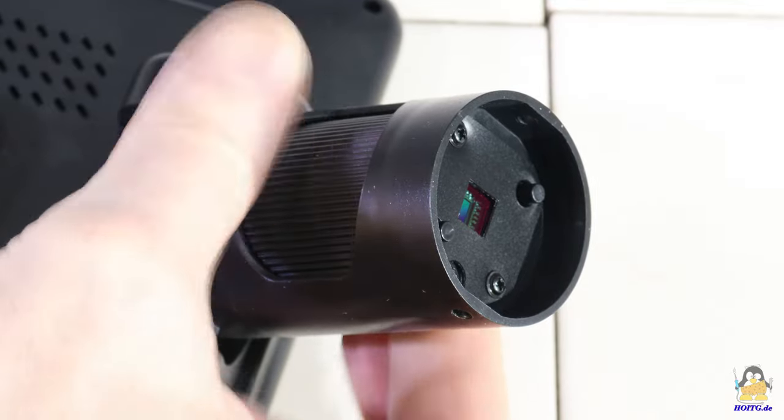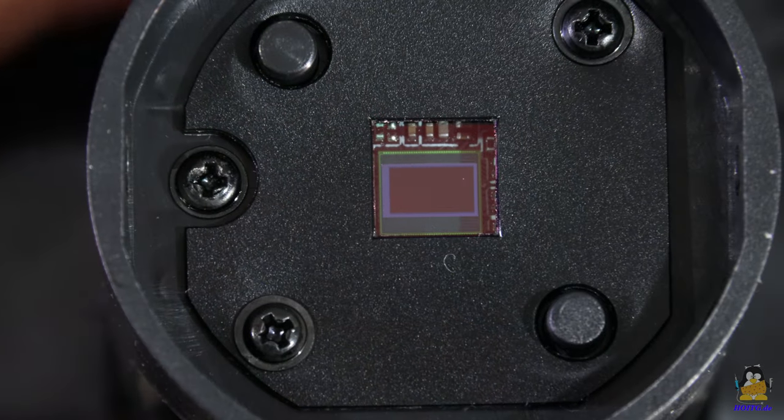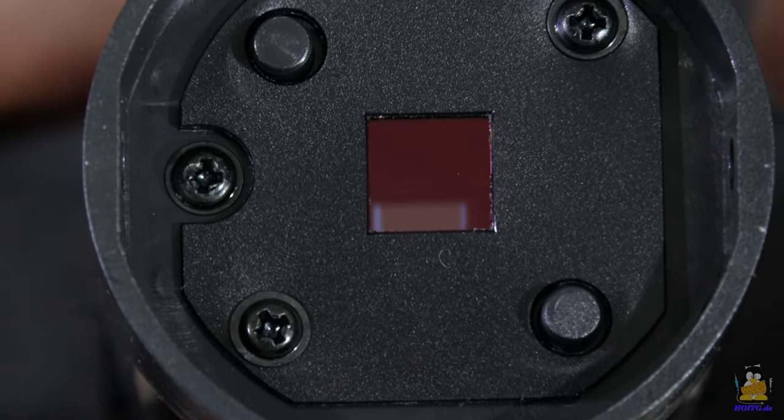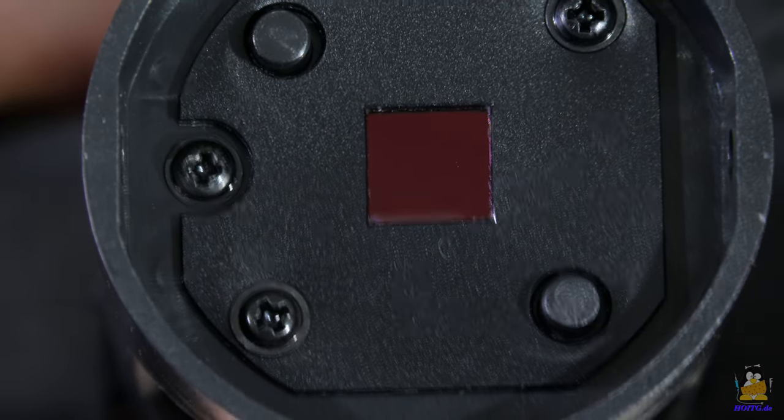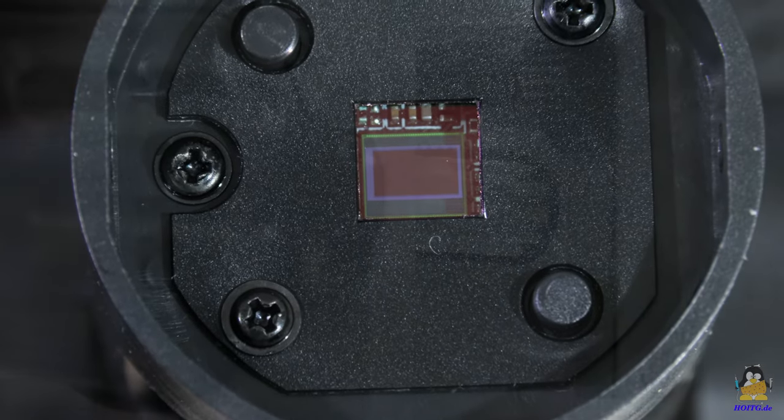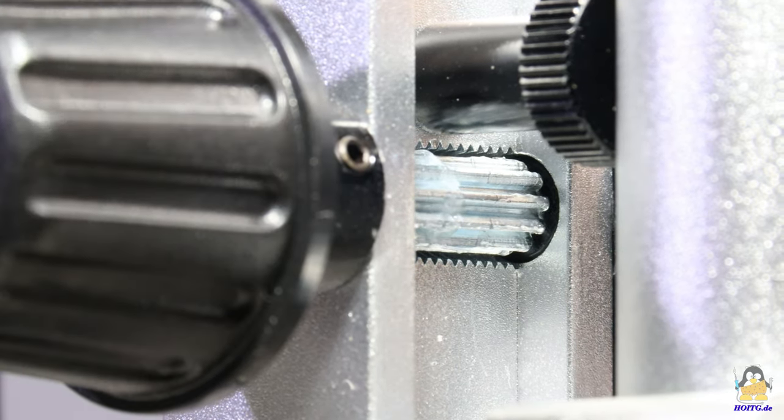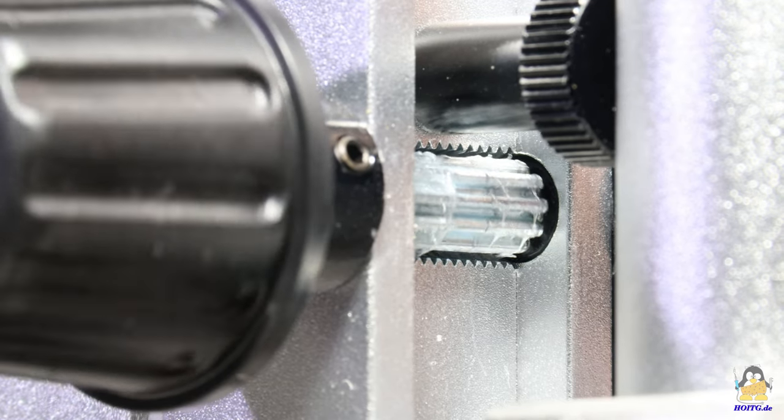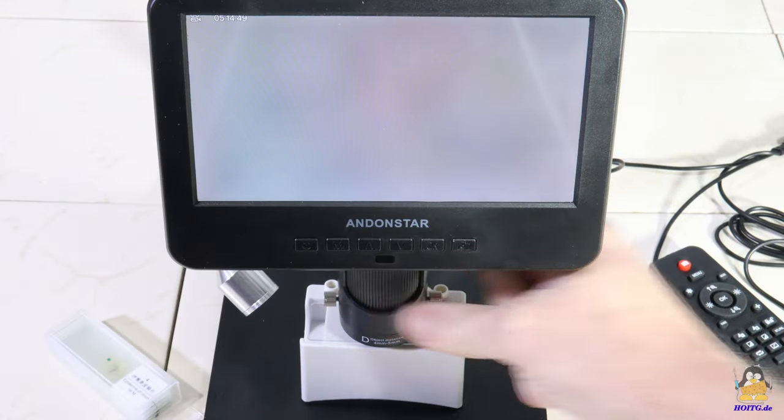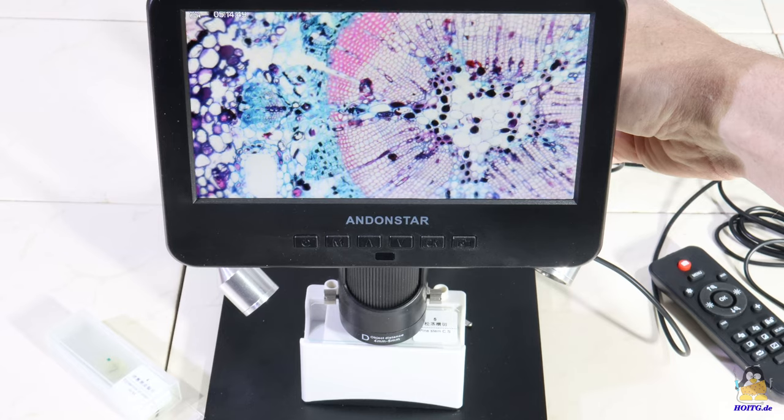The same applies to the height adjustment wheels. Both the mechanics on the tube as well as the height adjustment works smoothly. The mechanisms aren't that bad. Focusing is therefore a bit fiddly, but overall it works well.